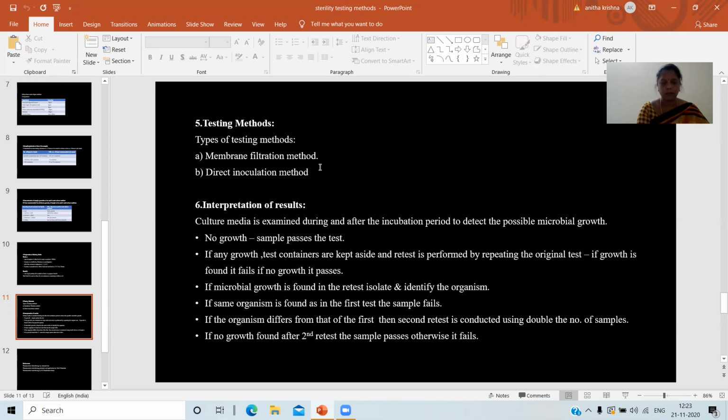Generally, you have to take the sample, put it on the medium, and mix the sample properly with the medium. If the product contains any antimicrobial activity, then it has to be neutralized with your penicillinase enzyme, and then incubate it in different media, soybean media and thioglycolate media, at required temperatures, and then the results have to be tested. Now here also you need to go for modifications.